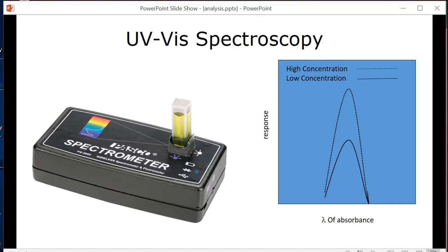And so what you need to do, though, is correlate that given absorbance with a set concentration to see if it's a linear relationship. And quite often it is, and you should know going into the lab whether it is or not. So you know that in UV-Vis spectroscopy when you do concentration versus absorbance, it is linear. If you had done concentration versus percent transmittance, as we did in lab 1, you know that it is not linear and it has to be changed to absorbance.